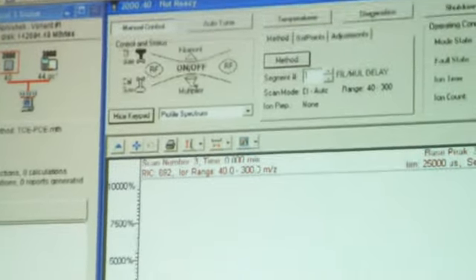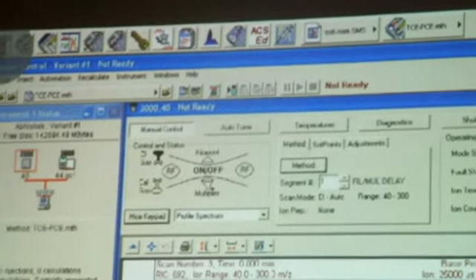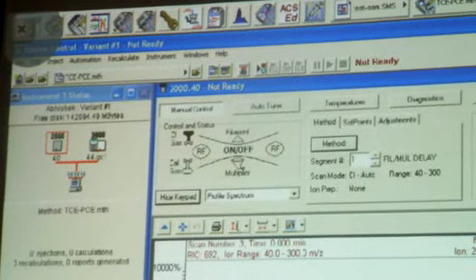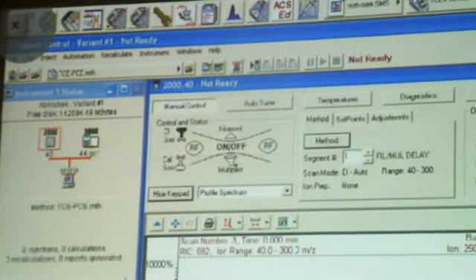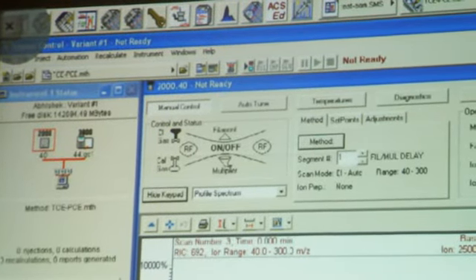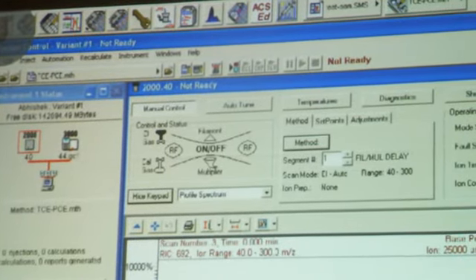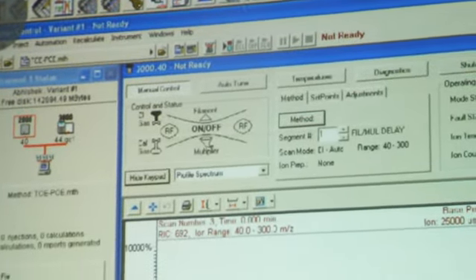And don't dip your needle too far into the liquid because it will ruin the machine. You just want some gas. Just put the needle in a little bit into the vial, not all the way. If you see any liquid when you're playing around with the injection, I don't know if you're going to go through this, but sorry.